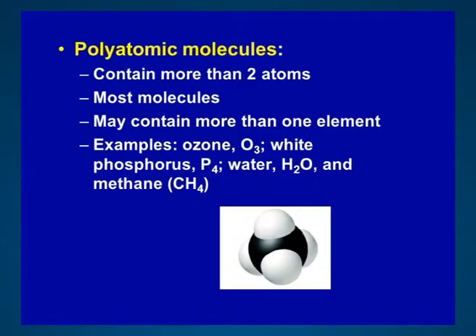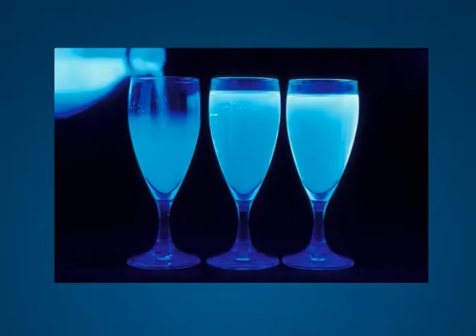The property of fluorescence is caused by a polyatomic fluorescent molecule which is known as a fluorophore. Fluorophores are the components in the molecule that cause fluorescence. Ultraviolet fluorescence. Ultraviolet radiations play an important role in forensic examination of documents. Security documents have significant covert features. Such features produce authenticated images when examined under UV luminescence.